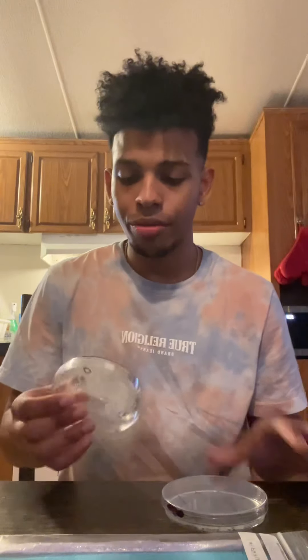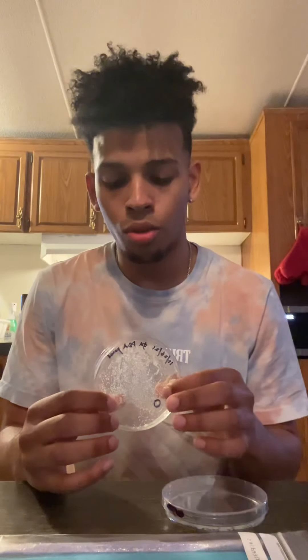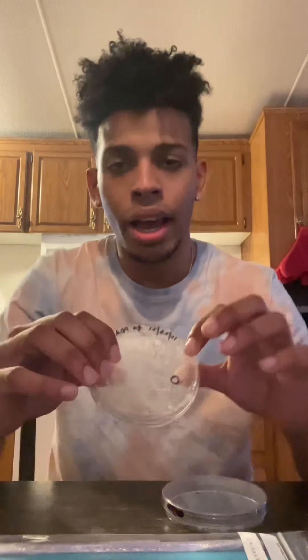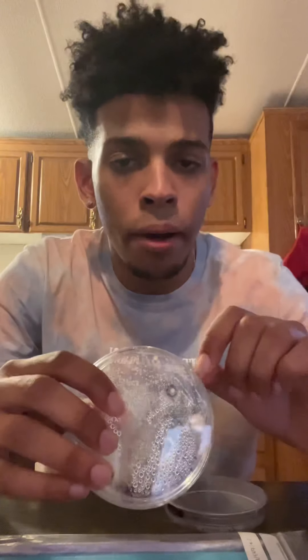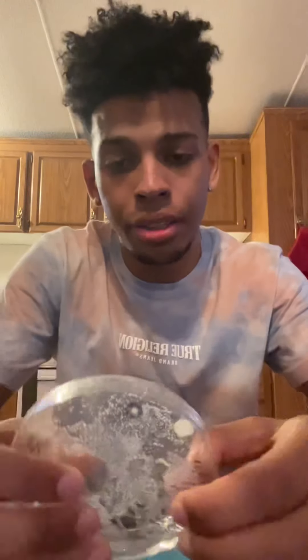Hello. Today I'm going to be streaking for isolation. So right here, I have my yeast colony already incubated, and I have circled the colony that I'm going to streak for isolation.